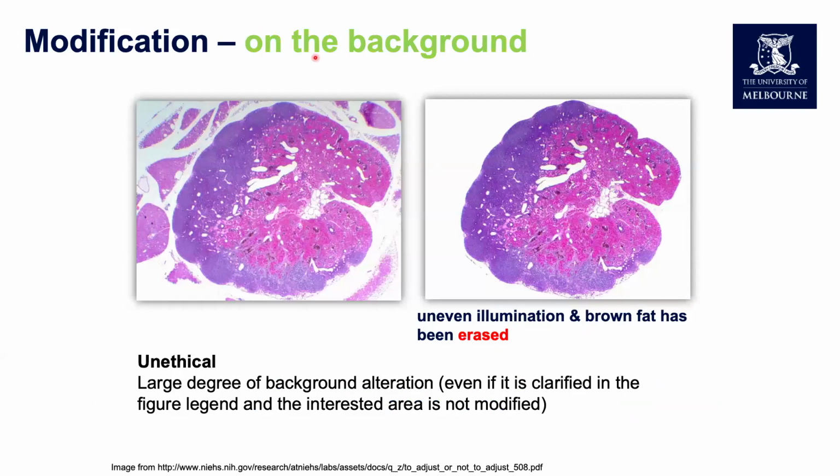Next thing is modification on the background. So here we've got a piece of tissue and they've taken out all of this background tissue. And they've also evened up the illumination as well. Here we're saying that this is unethical just due to the large degree of background alteration.